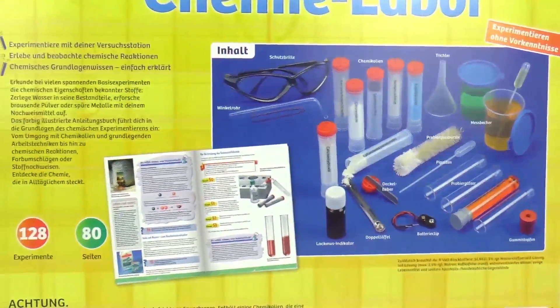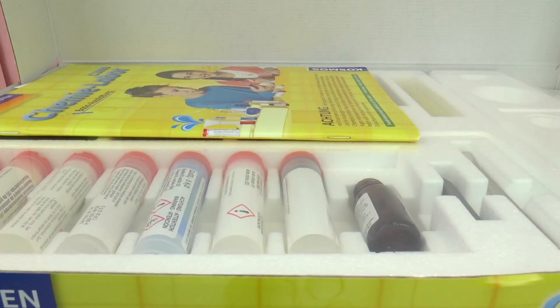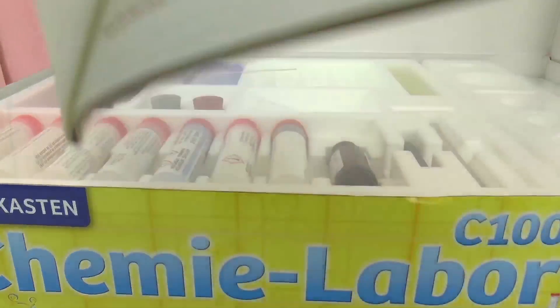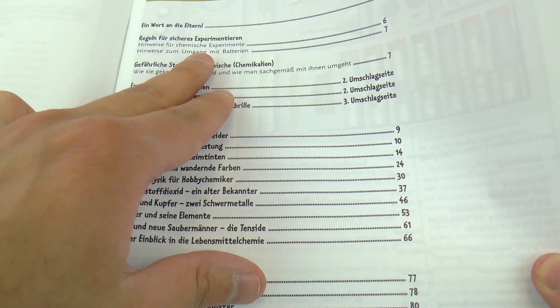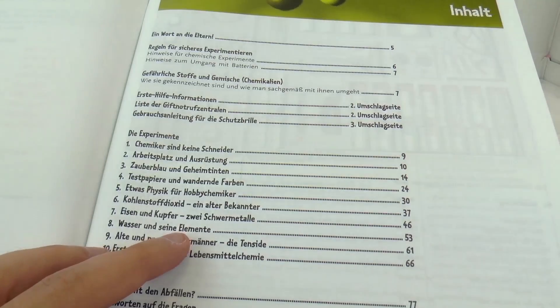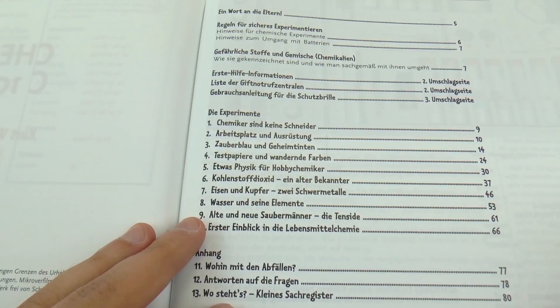So I think we should go ahead and get started and open this up. Here we can see everything included — we have some chemicals and our 80 page lab book which will explain all of the experiments. Here we have the chem lab C1000 with a table of contents. There's going to be some safety things to make sure the experiments go alright, as well as explanations of the chemicals and all the different experiments. Looks like a lot of fun, but we won't be doing that today — you can stay tuned to watch this later.